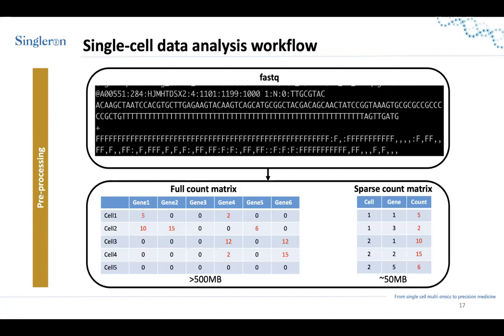But we need to look in a table to understand really the probability. The character itself, I don't know by heart. It's just a shortcut to this probability. So of course if the error probability is high, then the Phred score is low. Okay, so this is only for one read here. The sequencing that you see is only the sequence of one molecule, and you have millions of molecules that are sequenced. So this is only for one.